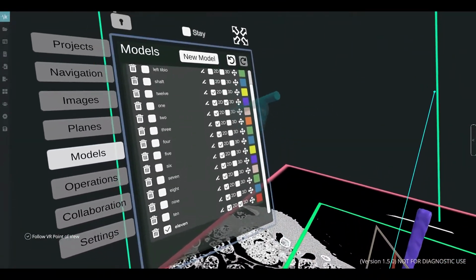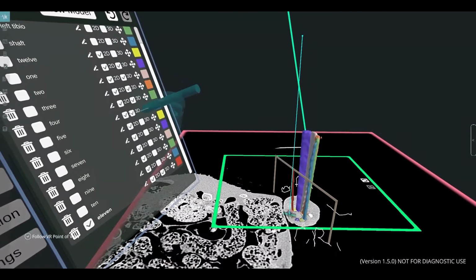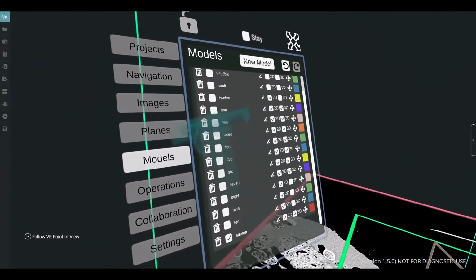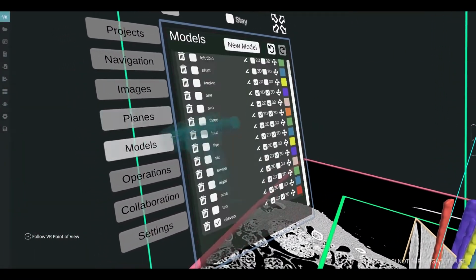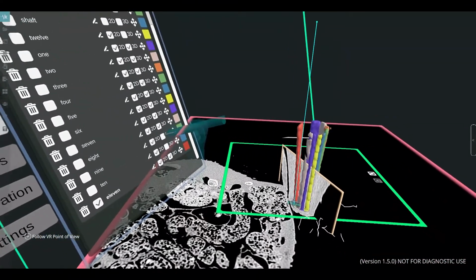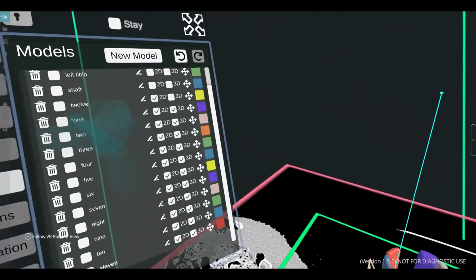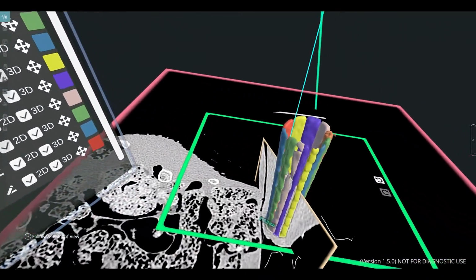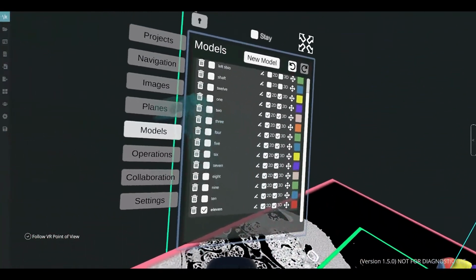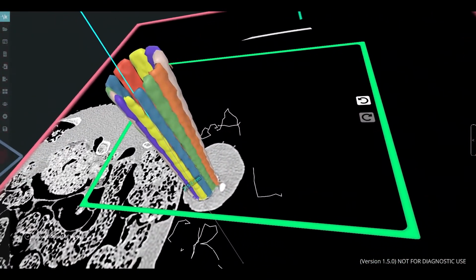Okay. So I'm just double checking. You take this clipping plane off. Again, if you left that clipping plane in, the center of it will be reported. So that's a nice central point. And we have now divided the shaft, the mid shaft, into 12 pieces.